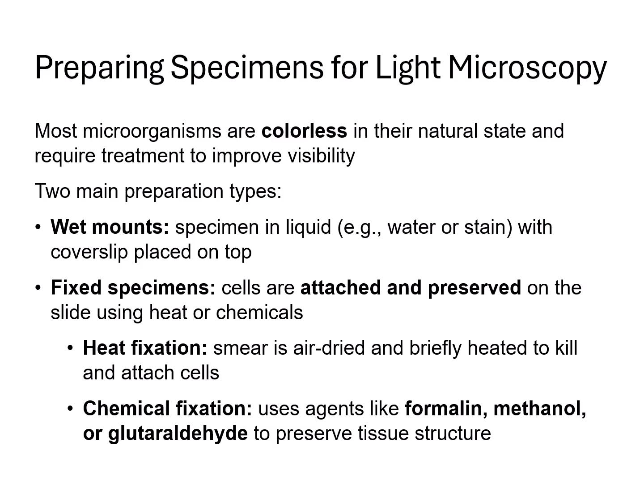Most microbes are colorless or transparent in their natural state, so we need to do something to improve their contrast and visibility before we look at them under the light microscope. And there are two main ways to prepare your sample. One, the easiest way, is a wet mount.